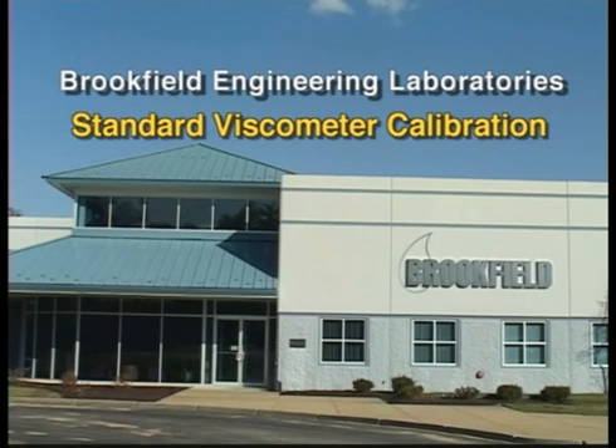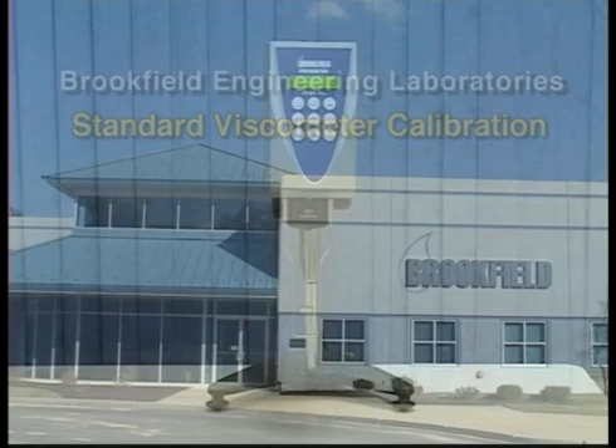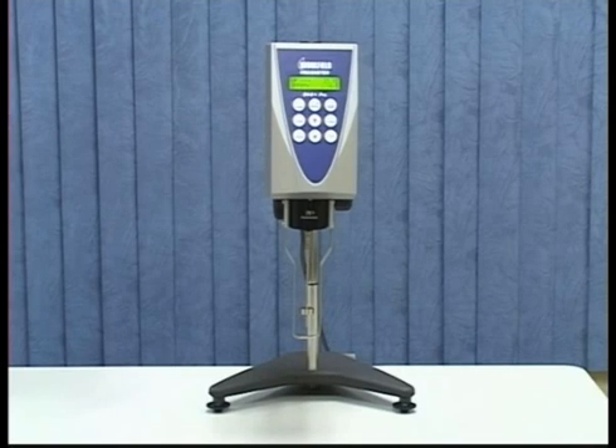This video will show the standard calibration routine recommended by Brookfield Engineering. A periodic calibration check is essential to ensure your viscometer is working properly.